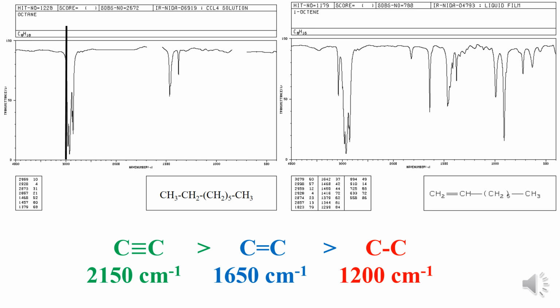So a partition line at around 3000 centimeter inverse, and you see stretching frequency for the CH bands. So CH stretching bands for octane are around 2867 to 2969 centimeter inverse. So you can see this value is coming close to 3000, but it is not exceeding 3000.